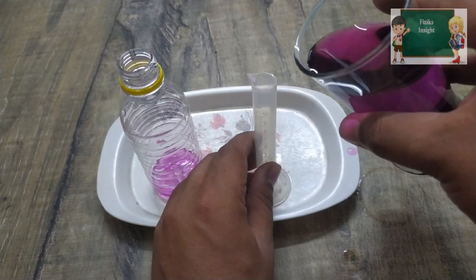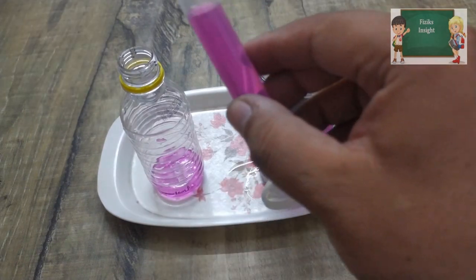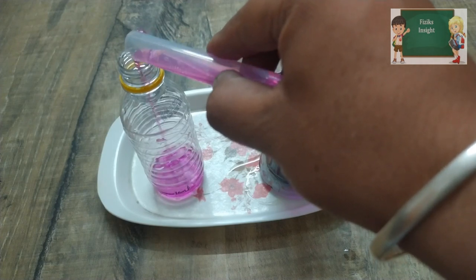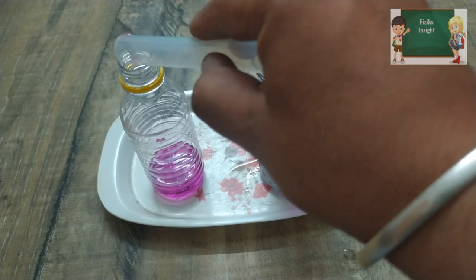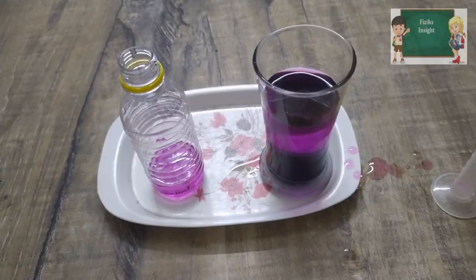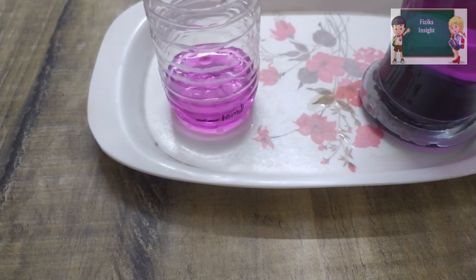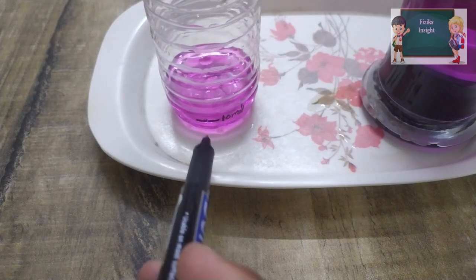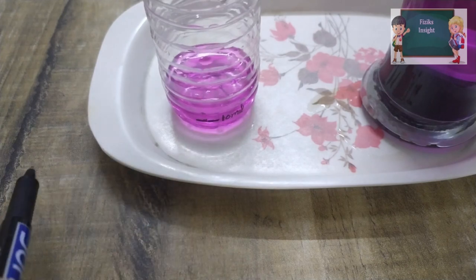Add the next 10 ml of liquid to the bottle and again make a mark. Now this mark indicates the capacity of the cylinder at 20 ml.